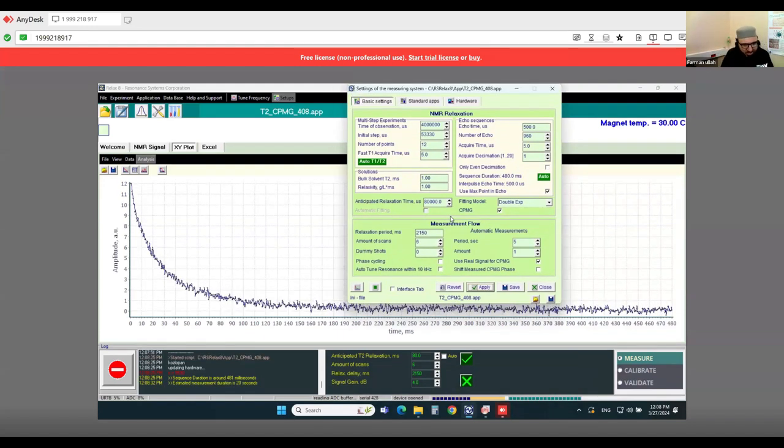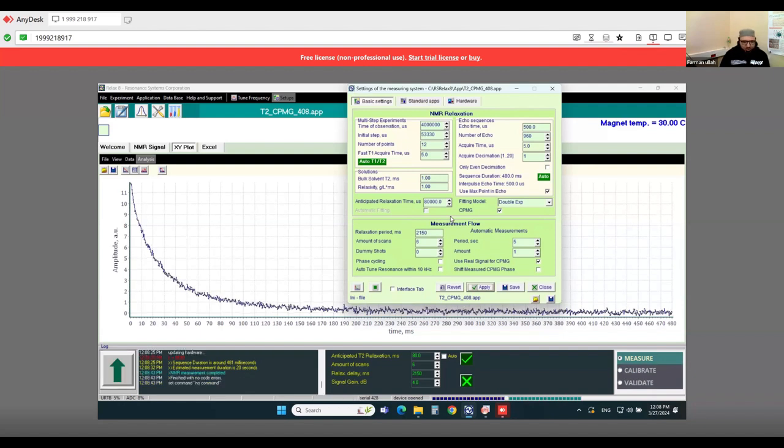Another thing which is happening here, I will also show in case such things are happening with you. You see here there's a very noisy result. So here two things we can change to reduce this. First of all, we will change the scan. I'm using here 50 scans, let's suppose. Even if you go to 100, different samples need more scans. The second is the signal gain.